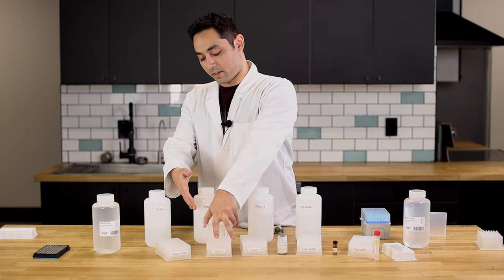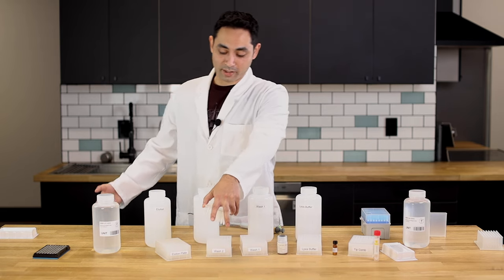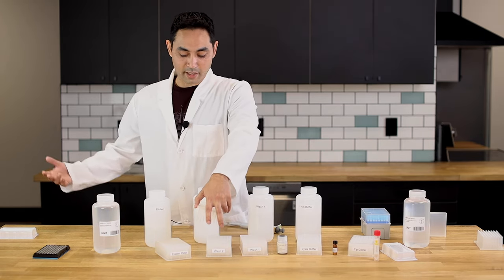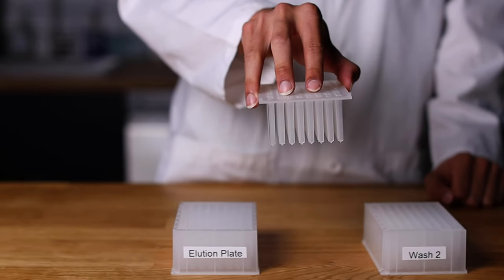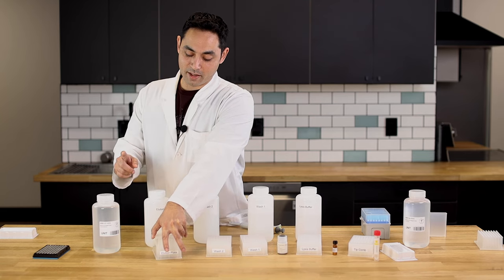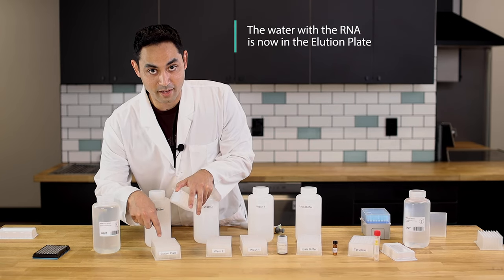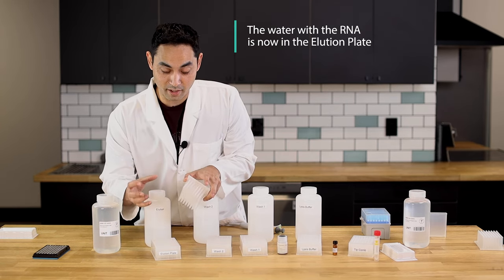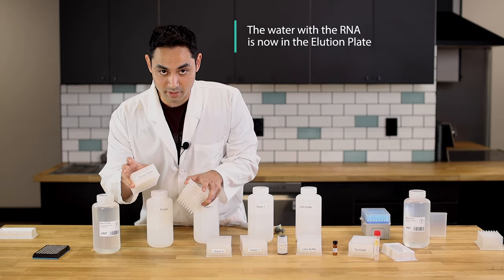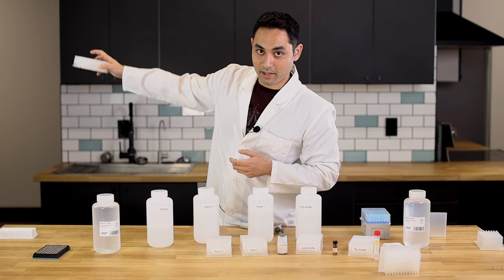Lastly, you have your magnetic beads again on the rods and it's elution time. We're essentially telling the beads to give back that RNA. The magnetic beads stay behind, but the water that now has the RNA is collected — so the beads are trash and the RNA solution is the gold. And then it's PCR time.